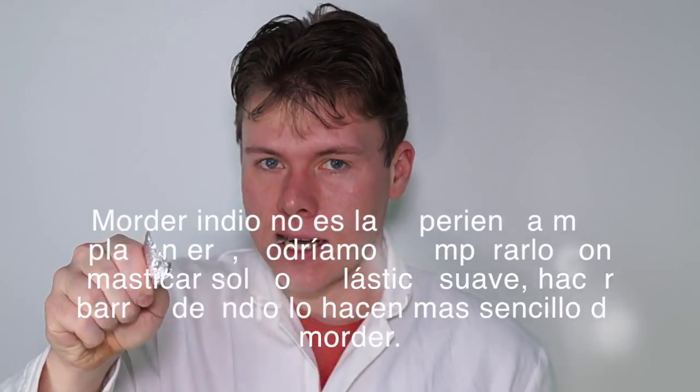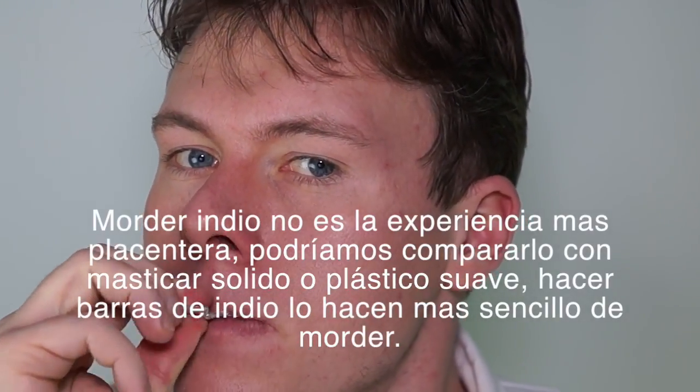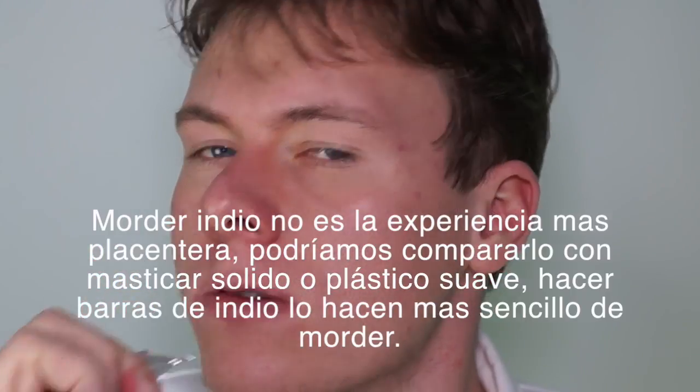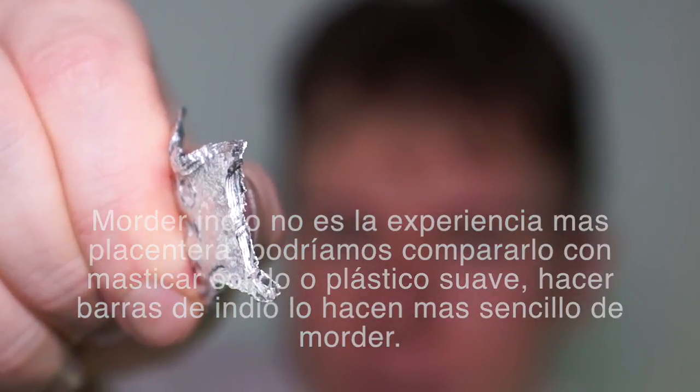Biting indium is not the most pleasant experience. It can be compared to chewing solid tar or soft plastic. Narrow strips of indium make them easier to bite.